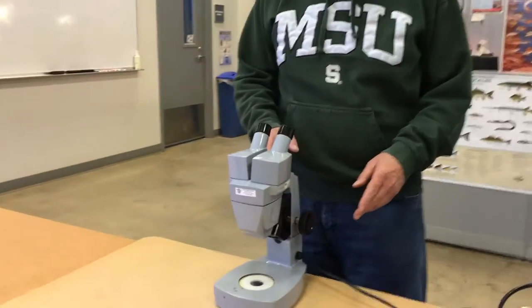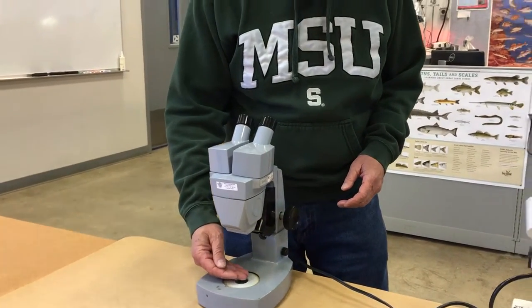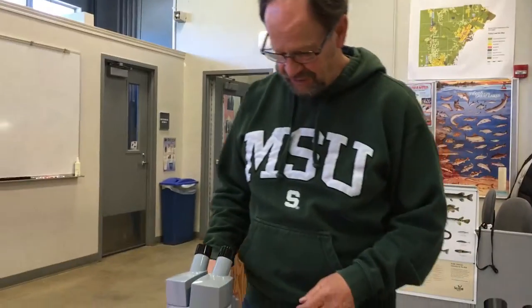This is a really great standby. This is the stage — this is where we'll put our little container with water, and we're going to be mainly looking at zooplankton before we put them on the compound scopes.